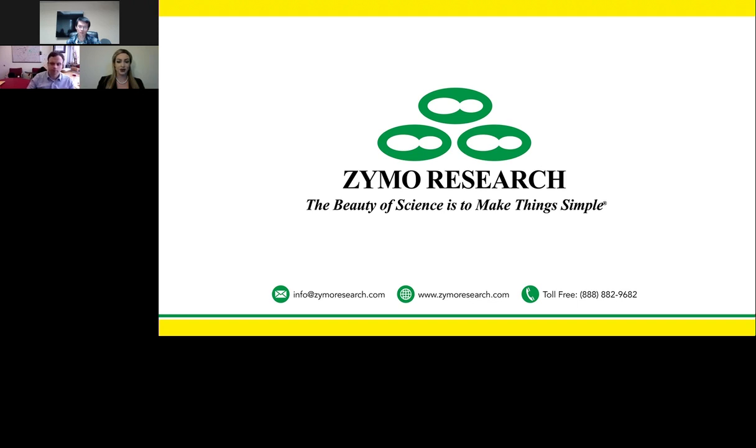Great. Our second question is going to be for Dr. Mason. How much do long reads versus short reads help for the controls? Yeah, we've seen that the longer the reads are definitely the better, so you can get much more unambiguous taxonomic assignment when you have the longer reads, whether it's single molecule reads or linked long reads. We've seen a lot better potential in those long reads for mapping. So if we can get them, we prefer them.